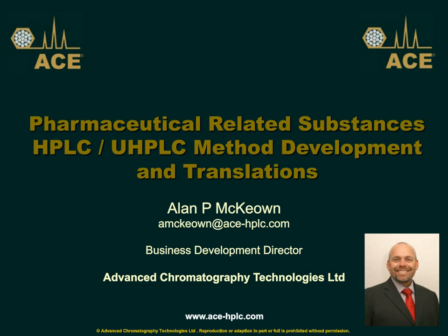So what I've tried to do in this seminar is describe from a first principles perspective, using the concepts of chromatography, why the method is what it is and how it can be developed relatively simply, to give you the answer quite quickly based around selectivity.